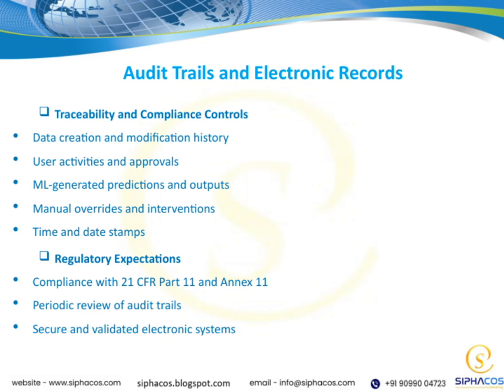When it comes to machine learning-generated predictions and outputs, it's important to record these as well, ensuring transparency in how decisions are made. Manual overrides and interventions are another key aspect. Anytime someone steps in to change or override a system's output, that action must be logged. Time and date stamps are embedded throughout this data, providing a precise timeline of all activities. This detailed record-keeping supports compliance and helps us meet regulatory requirements.